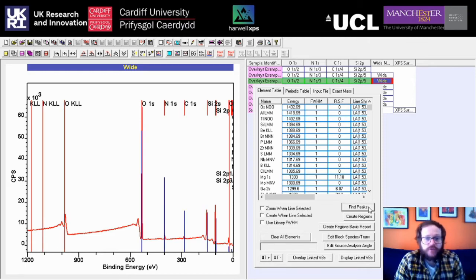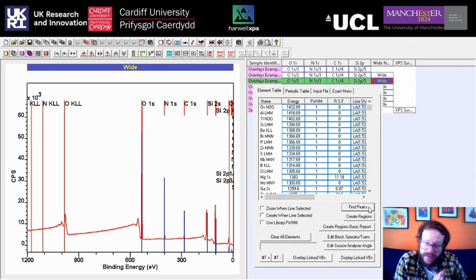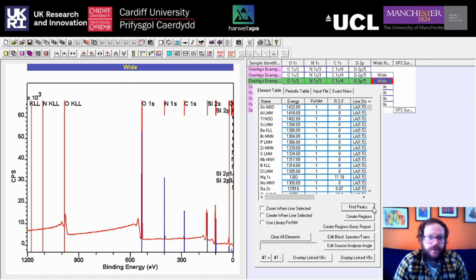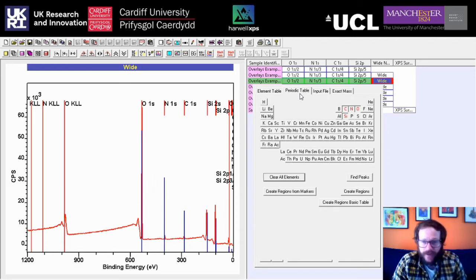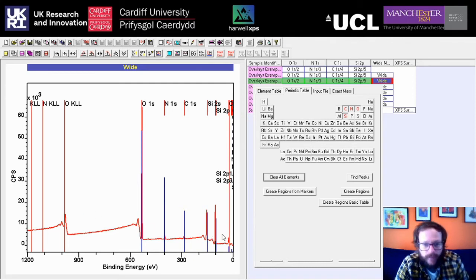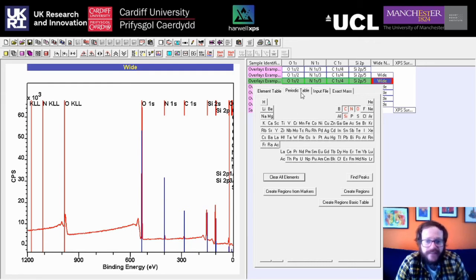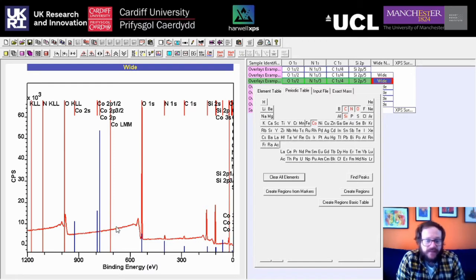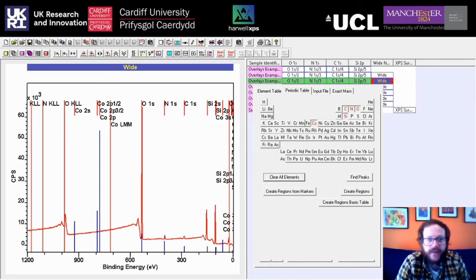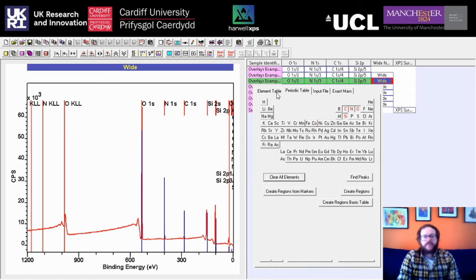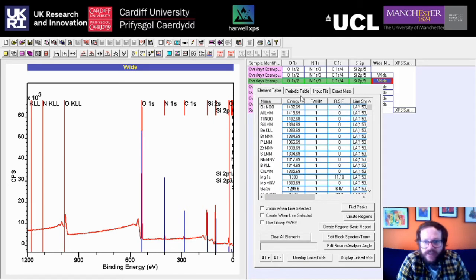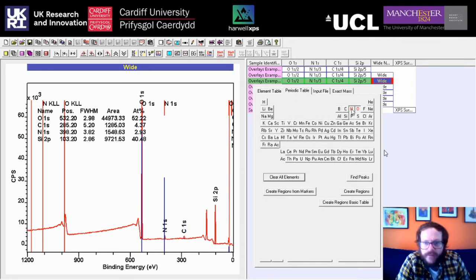This doesn't always work perfectly, so it's definitely worth double-checking with some knowledge of your samples to make sure it's not giving you any false positives. In this case everything we expect to be there is there with no undue surprises. If there's anything you want to remove or add, you can go to the Periodic Table tab and click on an element — it will show you where photoemission peaks come for that element and the intensity ratios for each peak. If we're happy with what we've got, we can then click back on Element Table, click Create Regions, and do some very simple quantification.